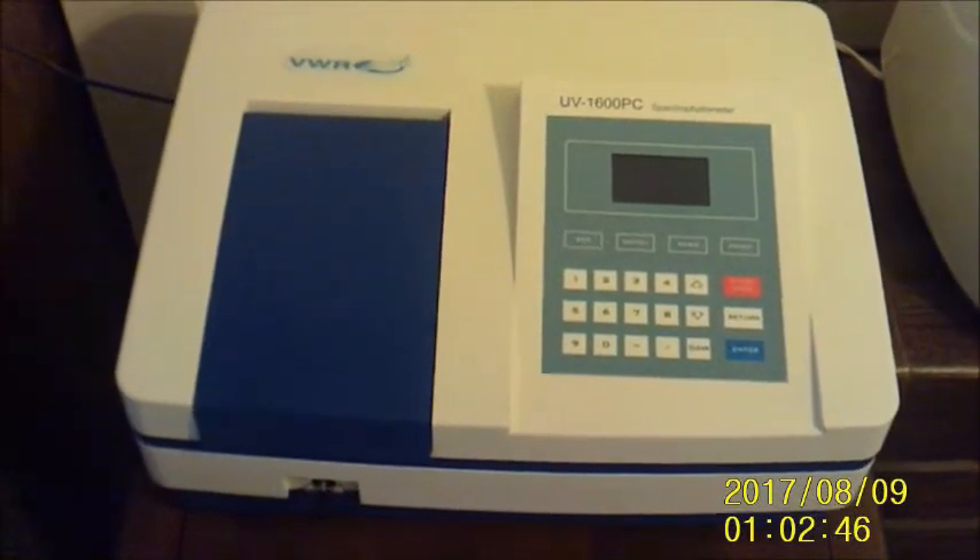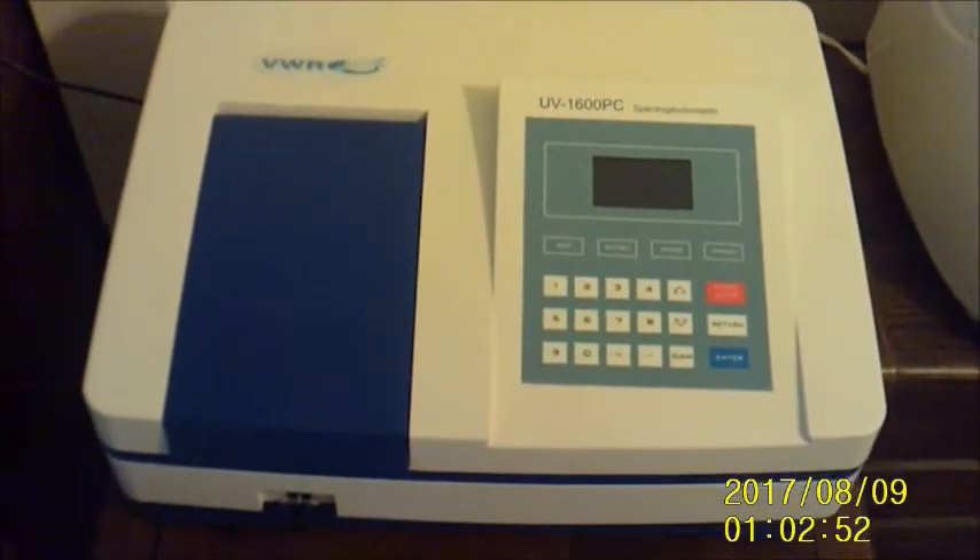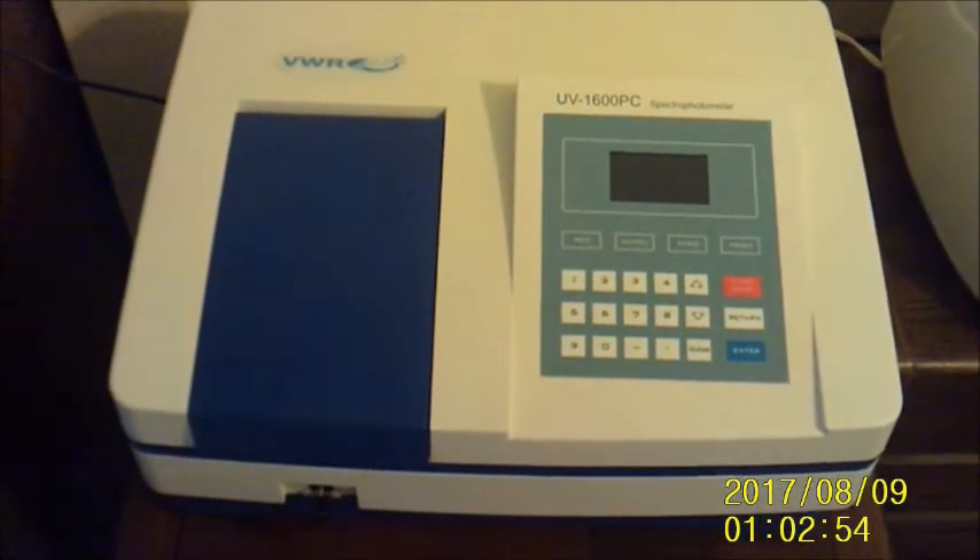Hello YouTube. I have finally received my spectrophotometer this morning. There are still a few bugs to work out, but it is operational and almost ready to go. So let me walk you through it.